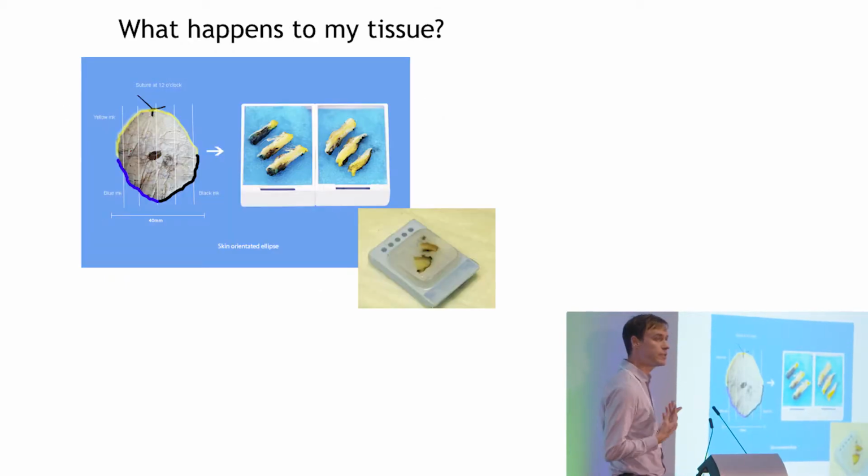So in terms of tissue samples taken for melanoma diagnosis, what we generally receive from the surgeon is an orientated piece of skin with the lesion in the center. It's orientated with a suture, and we spend quite a lot of time describing what we can see before we prepare the sample for examination under the microscope. We ink the various margins around the specimen with a special dye that we can see under the microscope. Then we slice the tissue very thinly, and what we're looking for is to see how deep into the skin the lesion on the surface is invading.